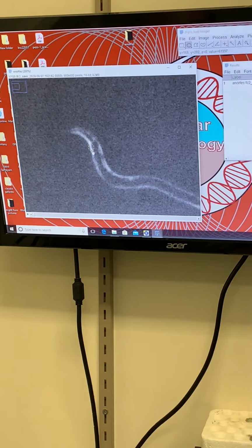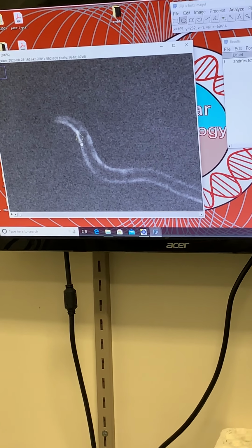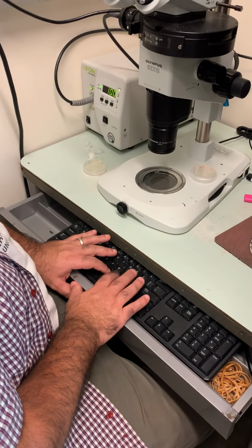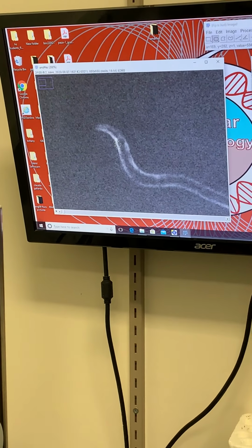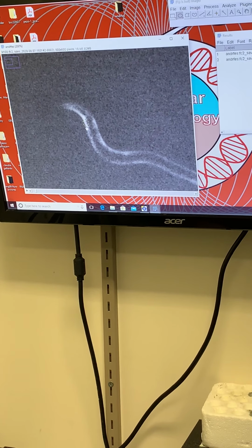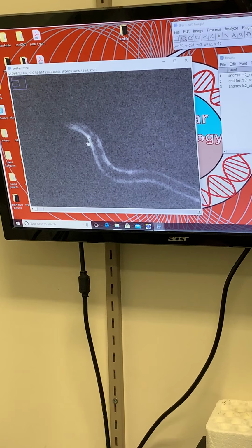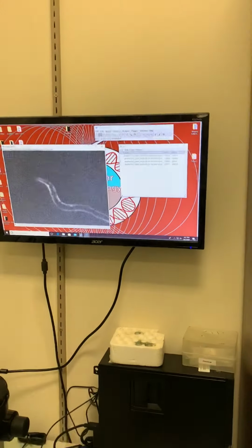Now you can click on the advance arrow to go one frame ahead. You can click on this arrow here, or you can click on the back arrow to go all the way back to the beginning. So I advance to the next frame, and I will reposition this thing, and I will press M again to get the next value. I advance to the next frame, reposition, M, advance to the next frame, reposition, press M, and so on.